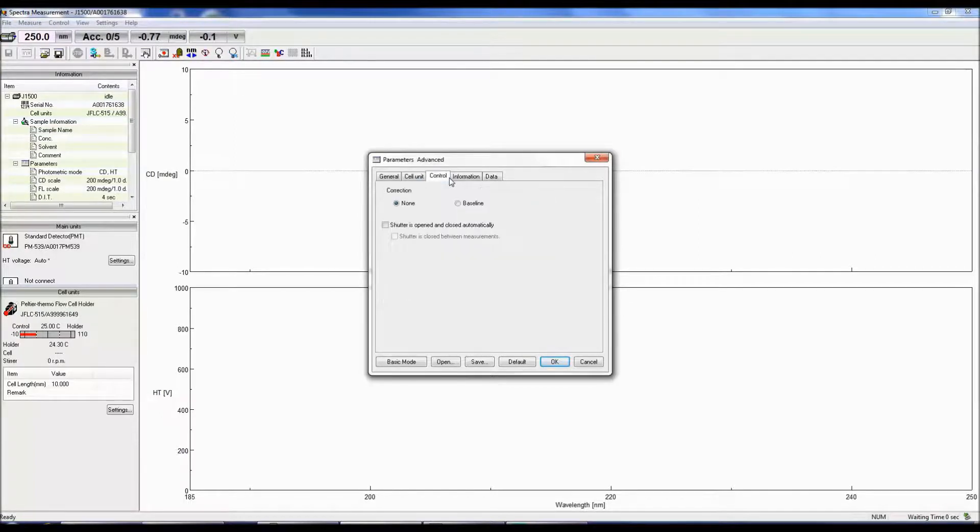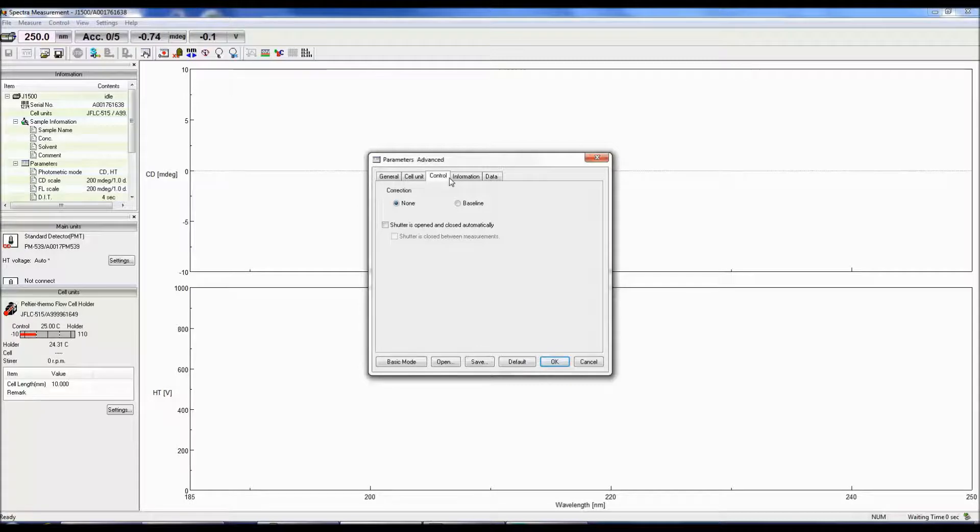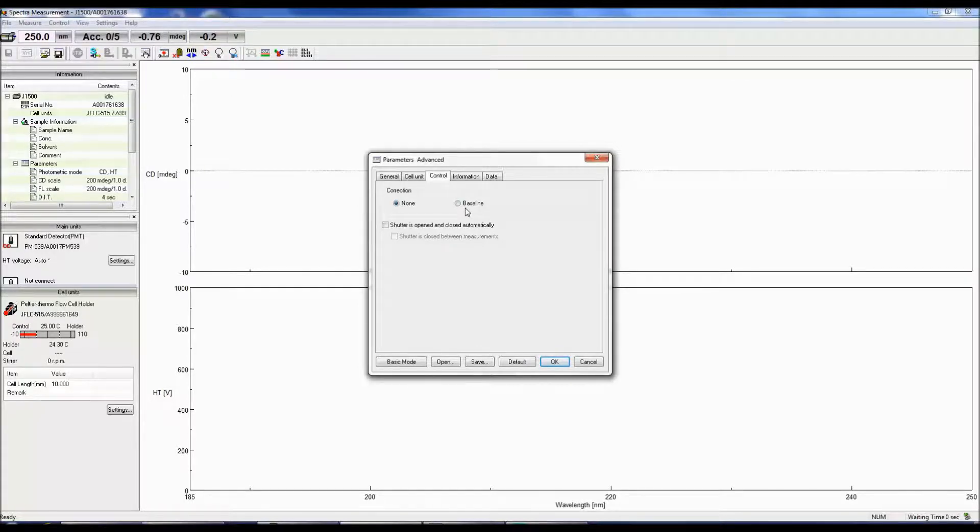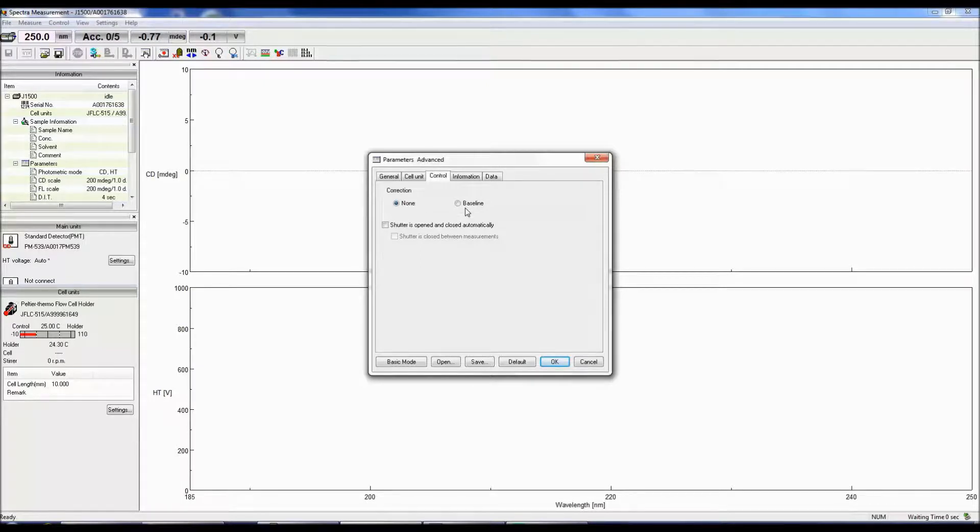Now we can click on the control tab. Here you can select whether you would like to correct your CD spectrum with a baseline spectrum. Keep in mind that if you choose to correct with a baseline, you will only have the corrected sample spectrum, not the raw sample spectrum.